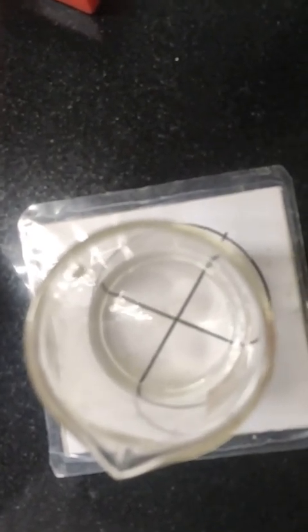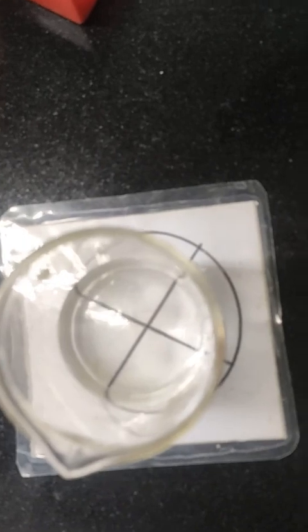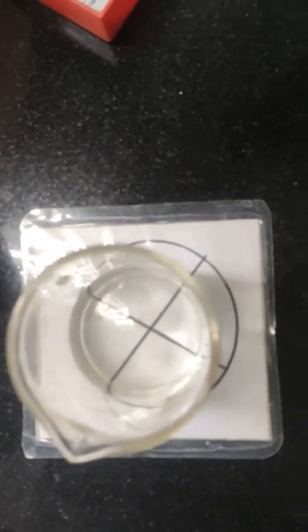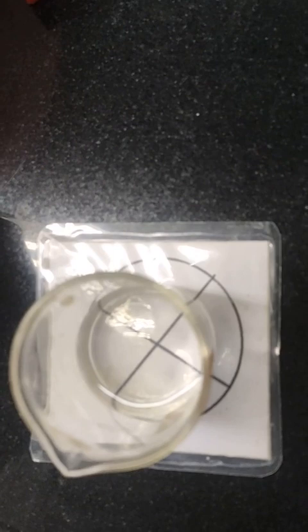Slowly, with the formation of colloidal sulfur, this cross mark will fade, and the moment the solution becomes very turbid, this mark will not be visible. So when this mark becomes invisible, I will stop the stopwatch and I will record the time taken.